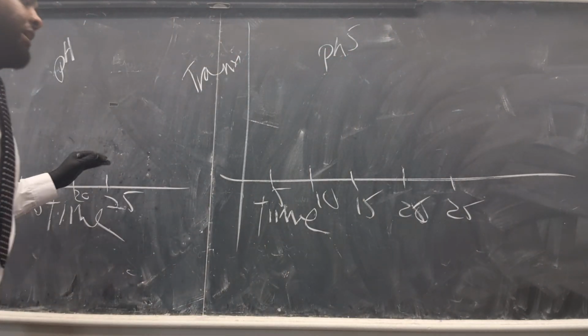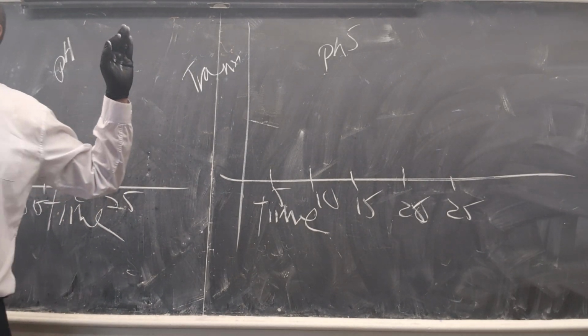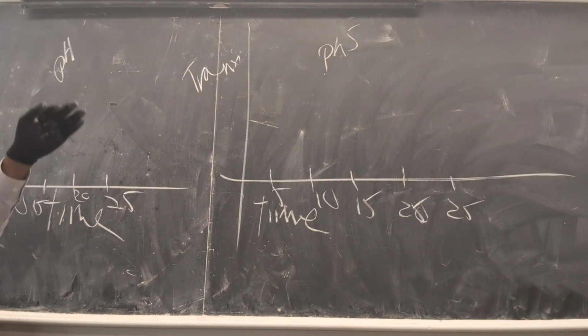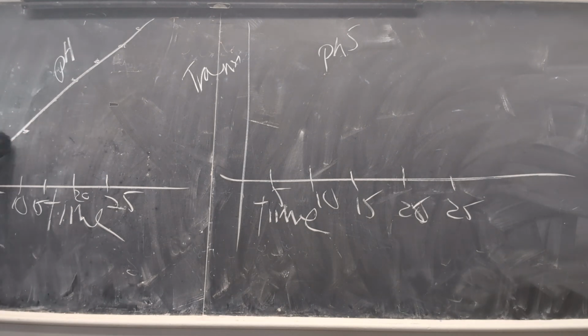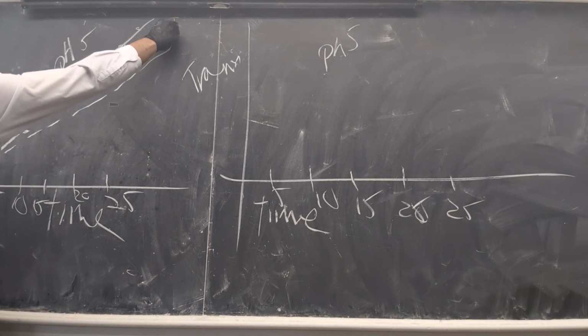So what are we doing? We are taking measurements at 5-minute intervals with a spectrophotometer for each test tube. For pH 5, we're going to learn that as time goes on, the absorbance increases like that. Then for pH 7, for example, it comes out like that. That's for pH 7. So what does that tell you?